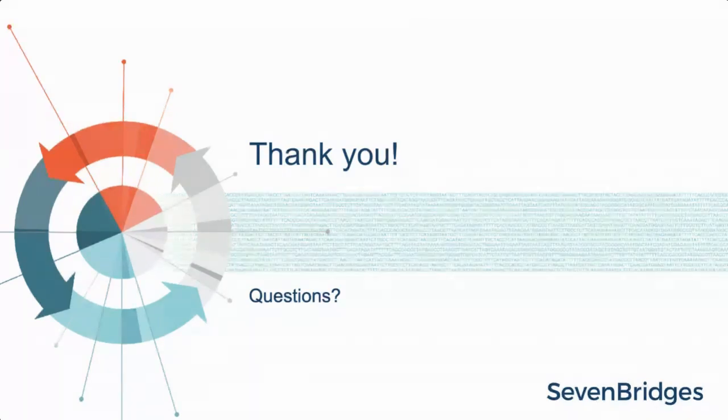A couple of quick clarifications. The benchmarking we presented was on the 3' end counting data, not on the full length data. And we got a question about which tools are available on which platforms. We're aiming to get all the tools available on all platforms soon.